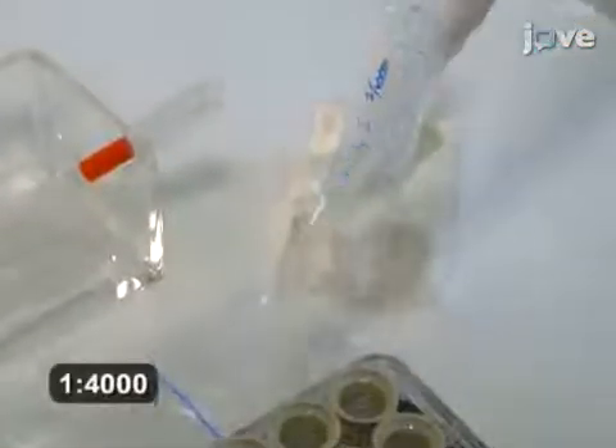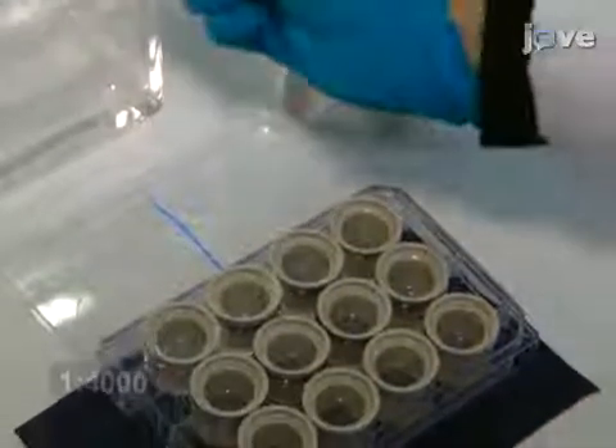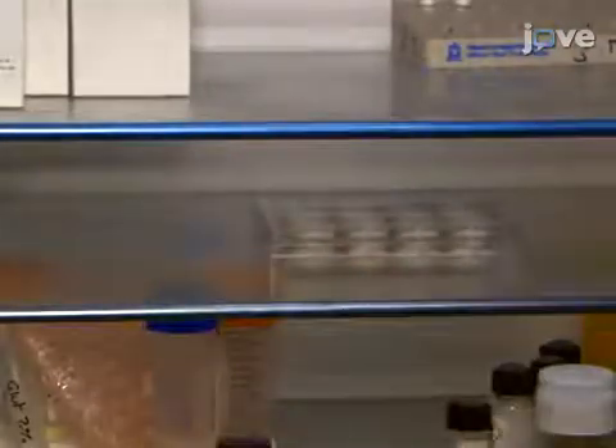Subsequently, incubate the sections with a rabbit polyclonal antibody against the cFOS protein in PBS-T with 0.25% bovine serum albumin for 48 hours at 4 degrees Celsius.